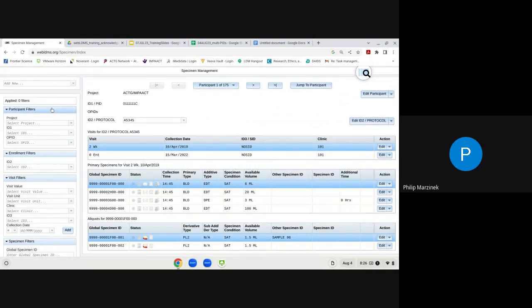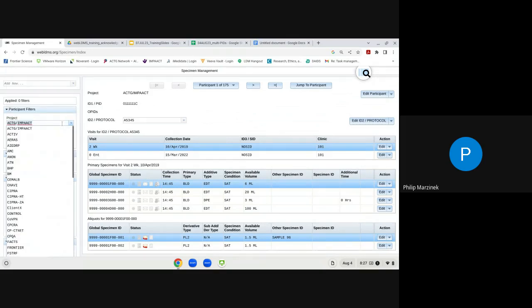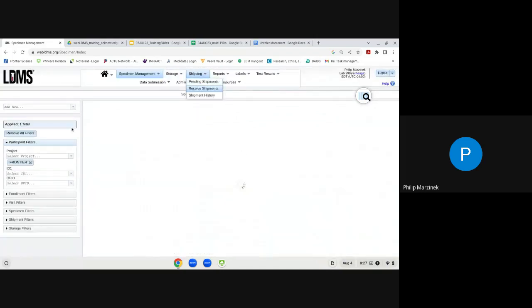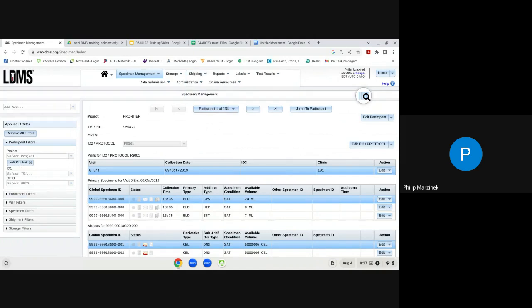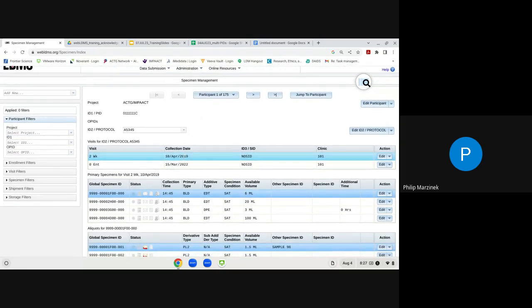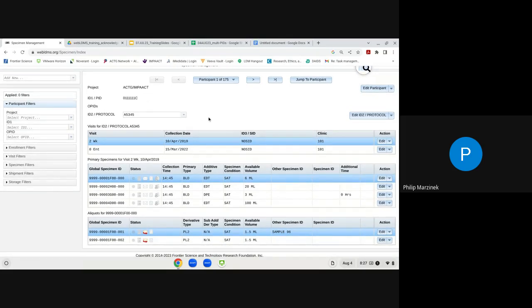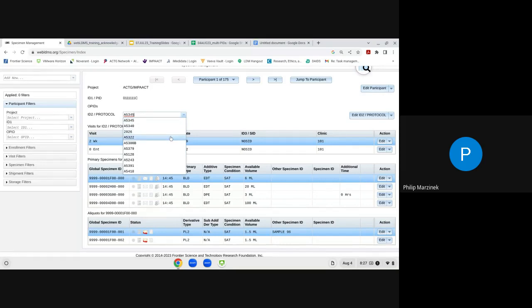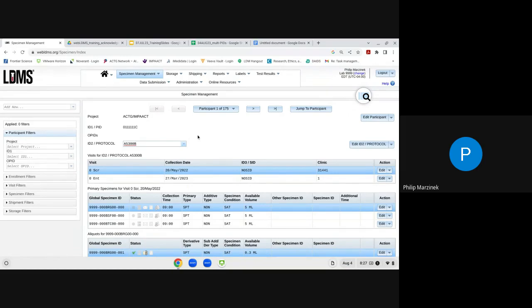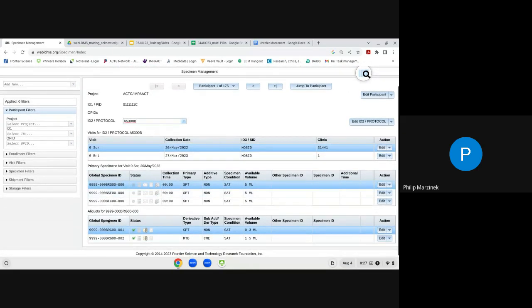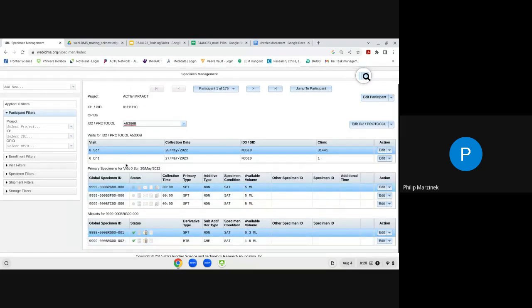The participant record shows all protocols, study visits, and specimens for a specific participant through dynamic functionality on one screen. The first level of dynamic functionality is the ID2 Protocol or Study field — a drop-down menu shows the different protocols the individual is enrolled in, and selecting a protocol updates the visit grid, primary grid, and aliquot grid to show visits and specimens specific to that protocol.